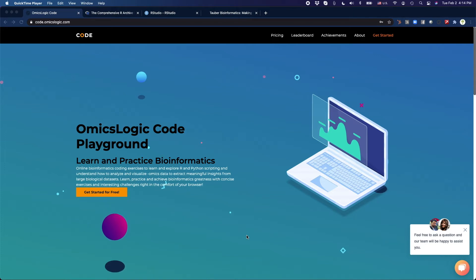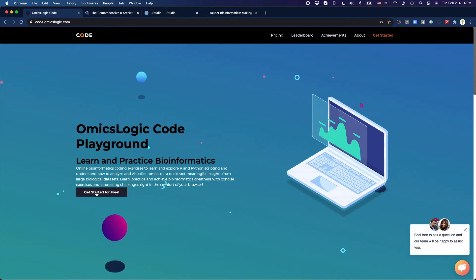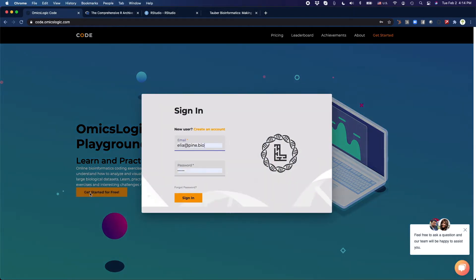So how can you get started with R and Python? Here we have the OmicsLogic Playground. All you need to do is click on Get Started for Free.